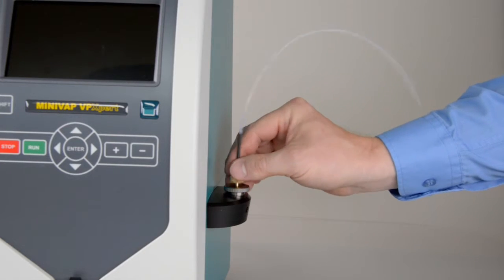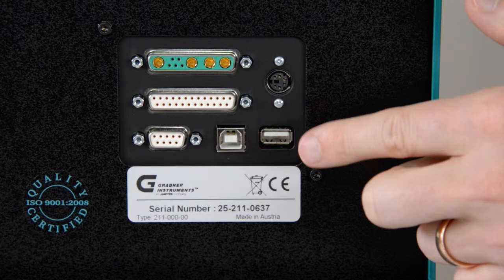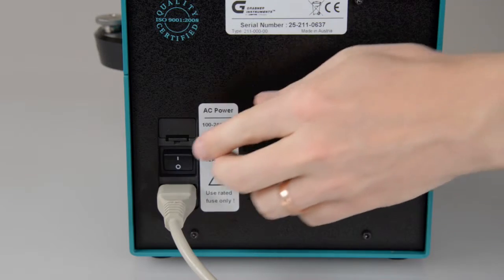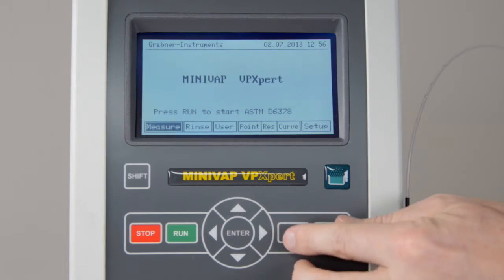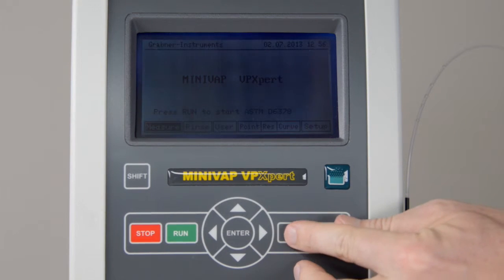Connect the sample tube. If you want to use a keyboard, attach it to a USB port on the rear side of the instrument. Turn on the analyzer. If necessary, change the display contrast by using the plus-minus keys.